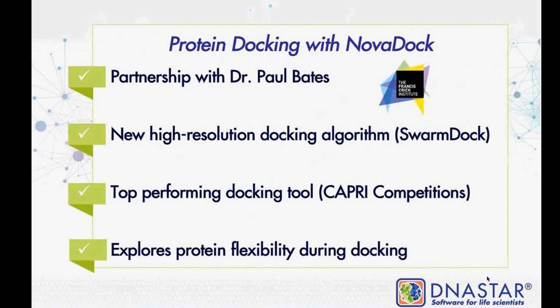Moving on to NovaDock, where the underlying algorithm for this application is the SwarmDock program developed by Dr. Paul Bates and his group at the Francis Crick Institute in London. This is part of a newer class of high-resolution docking algorithms where protein flexibility is really explored during the docking.